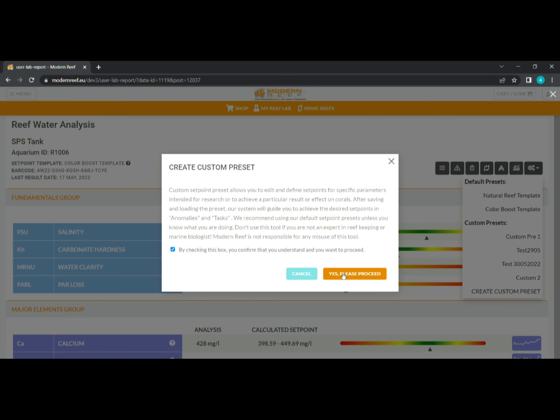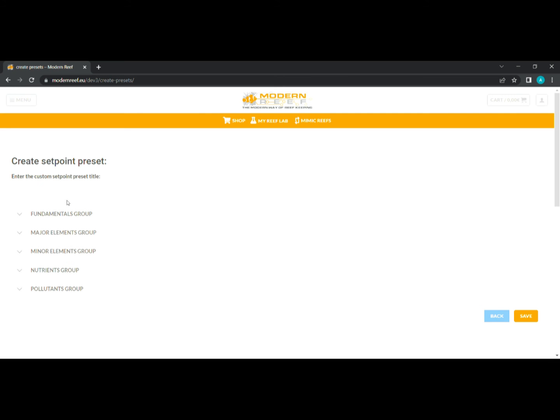But basically, if they use it only for basic stuff like nitrate, phosphate, each customer has a preferred way of levels and so on. So also for experts that want to test or whatever, right?